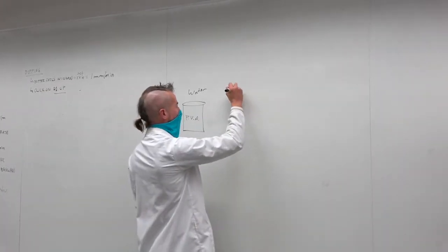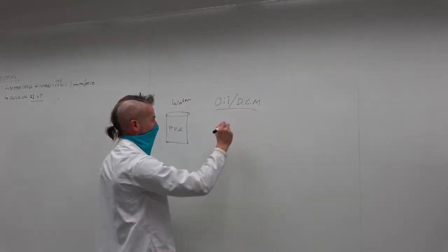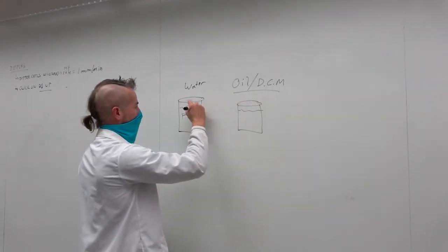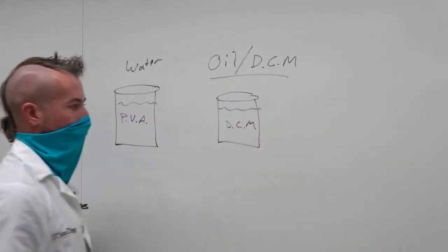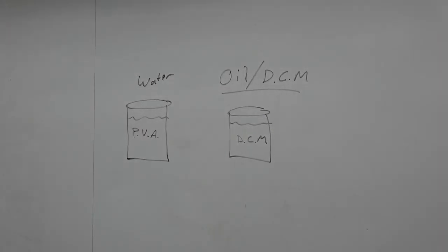The oil phase, which is going to be dichloromethane, is a separate solution. So the first thing we're going to do is make these two separate solutions, okay?